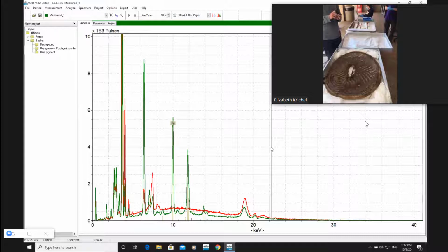Then there's a follow-up question. Can those two things, cinnabar and synthetic mercuric sulfide, be differentiated using the PXRF? Yes, you want to look at contaminants, but the good news is vermilion mercury sulfide is just that. There's mercury and there's sulfur, and that's it. But cinnabar can have traces of zinc, titanium, gallium, aluminum silicates. There can be all kinds of stuff in there too. So it's really the traces that are going to tell you what's going on. It's the details. If you have a lot of details, it's not synthetic. If you have no details, it's probably synthetic. The thing to remember is, the older an object is, the less pure the materials in its construction, so the more little peaks you're going to see.